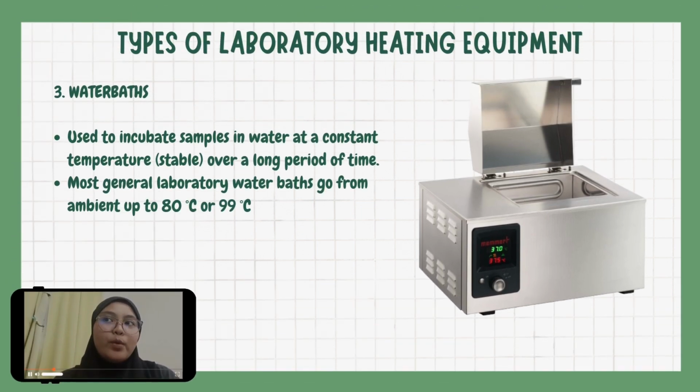Third, we have the water bath. A water bath is used to incubate samples in water at a constant temperature over a long period of time. Most general laboratory water baths go from ambient up to 80 Celsius or 99 Celsius.